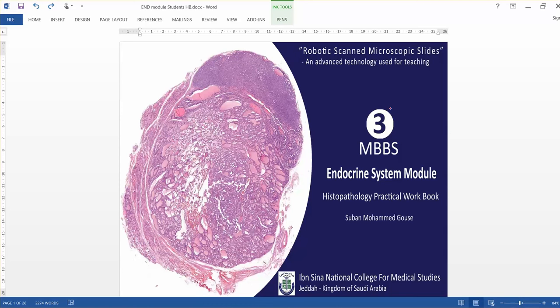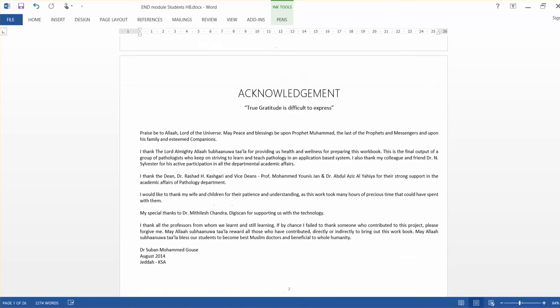Bismillahirrahmanirrahim. Dear students, this is a screencast for histopathology practical sessions, laboratory sessions for the endocrine system module.